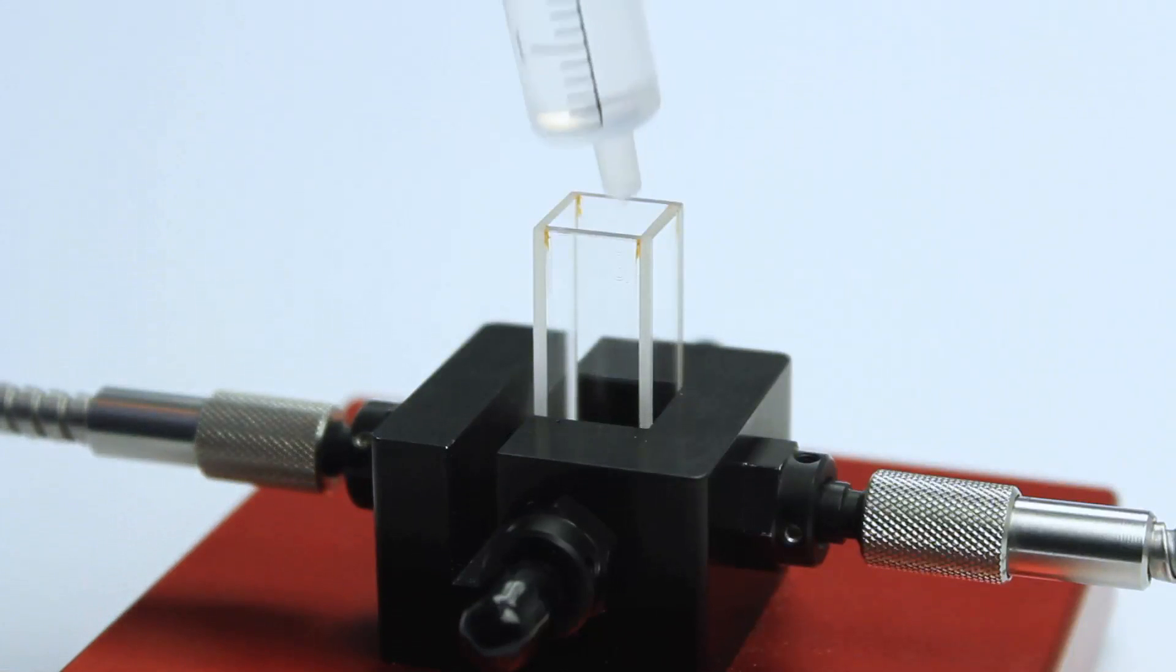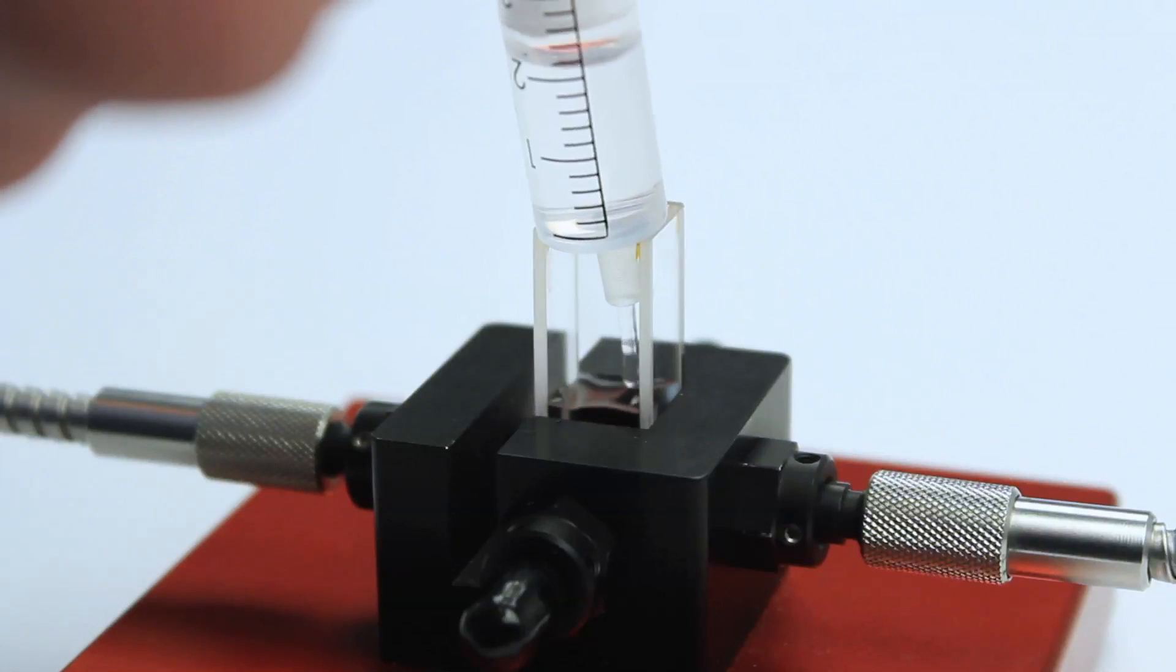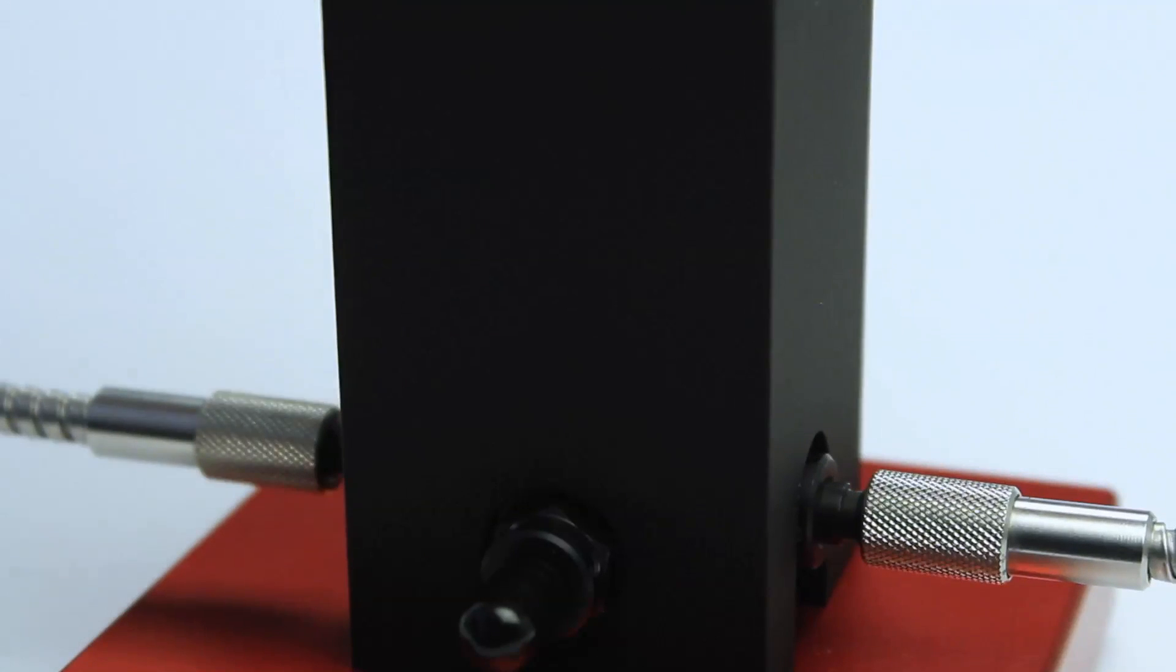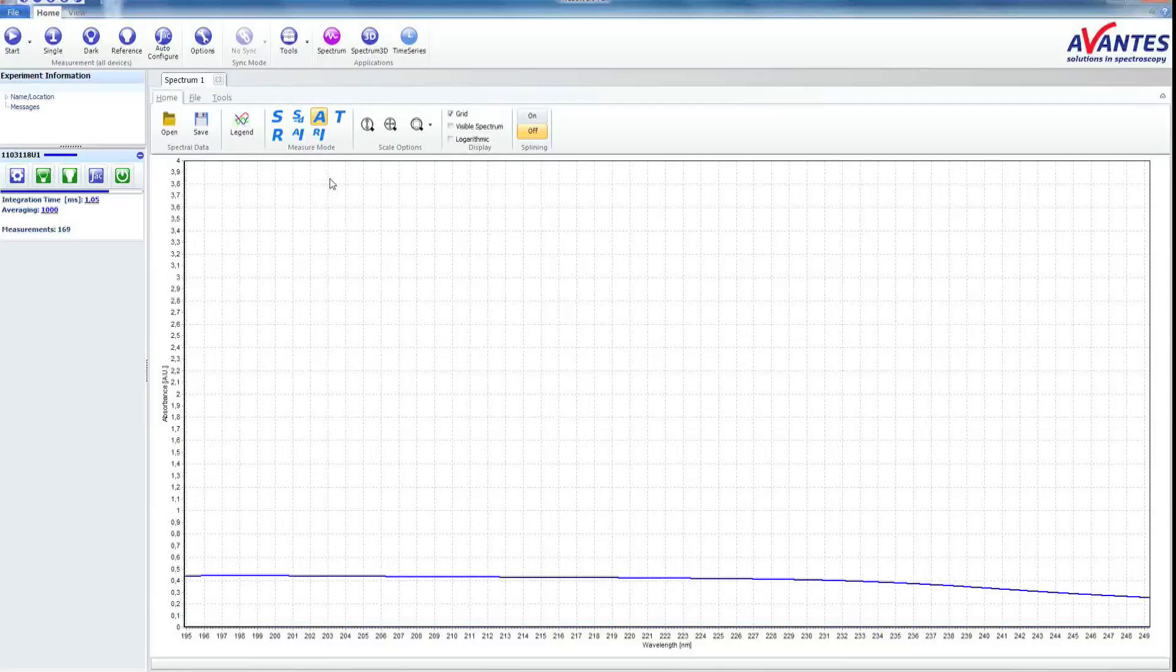Put your sample in the cuvette. You see the absorbance curve of the ethanol. You can also save this data.